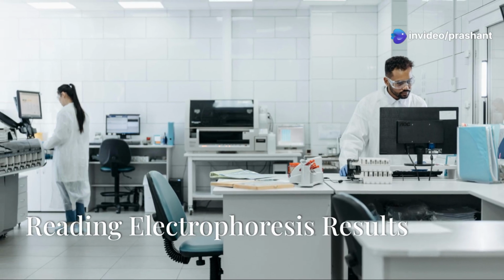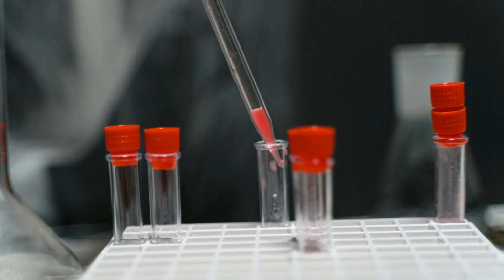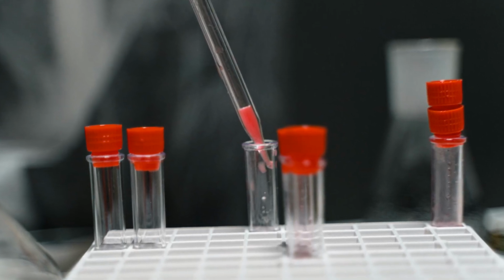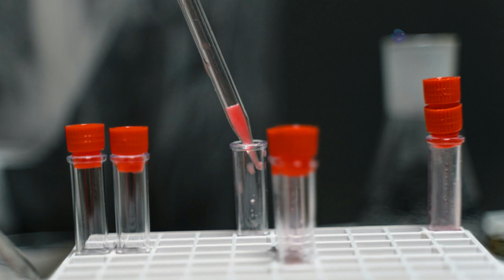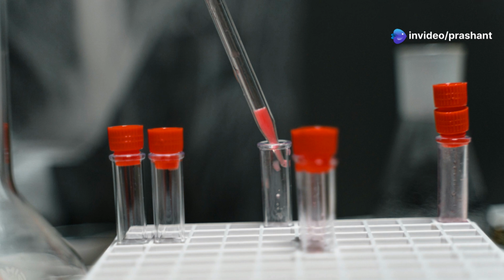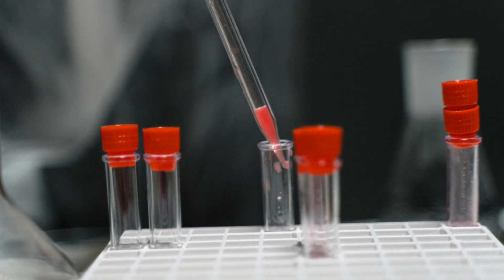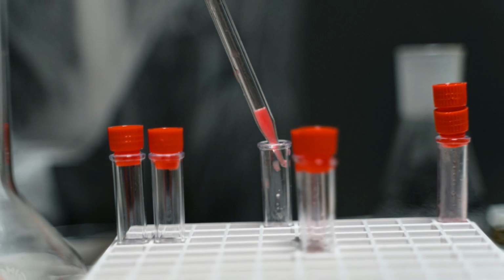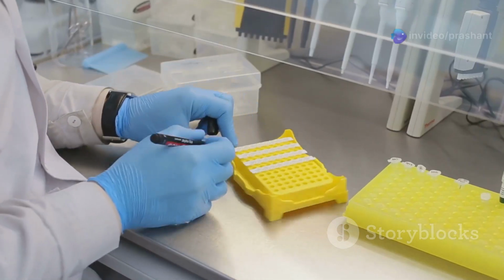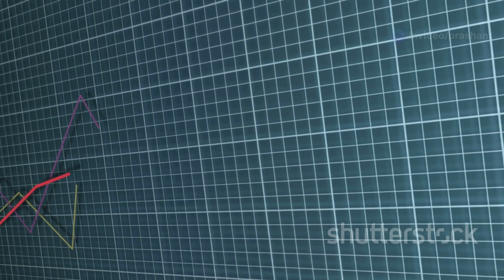Interpreting electrophoresis results is key to making the most of this technique. Here's a quick guide. In gel electrophoresis, results appear as bands. Each band represents a different molecule or fragment size. The distance each band travels in the gel corresponds to the molecule size. Smaller fragments travel further, while larger ones stay closer to the starting point. In capillary electrophoresis, results are displayed as peaks on a graph. The position and intensity of each peak help identify and quantify the molecules present in the sample.